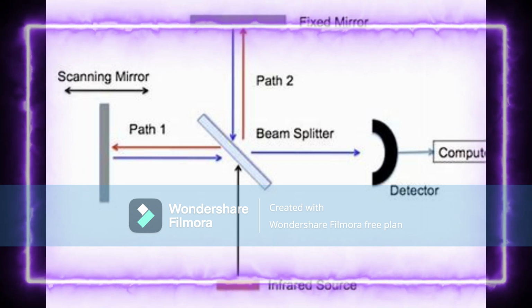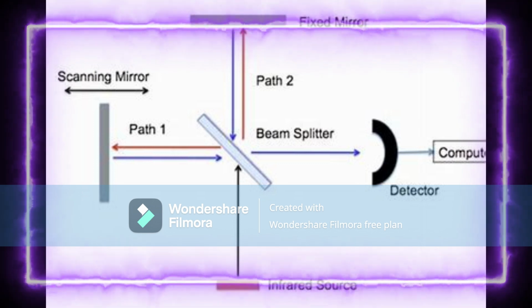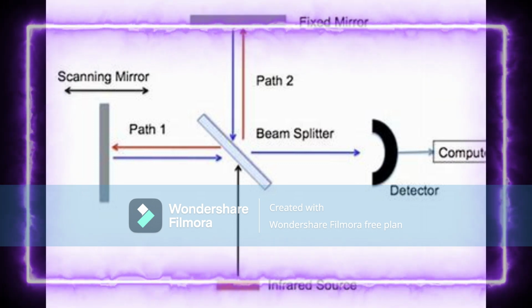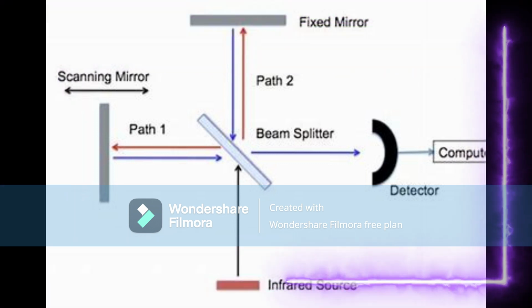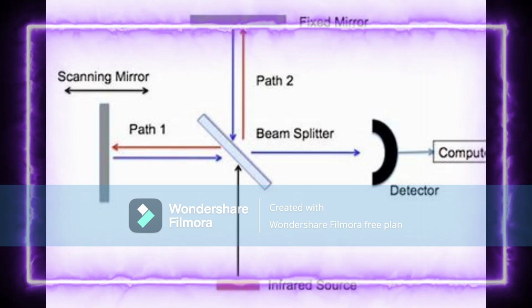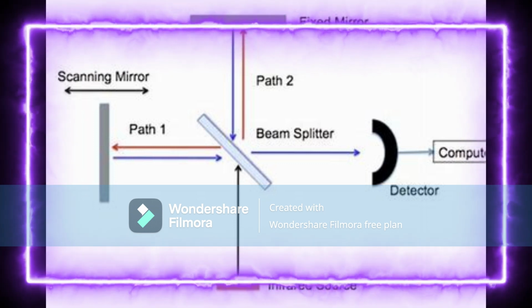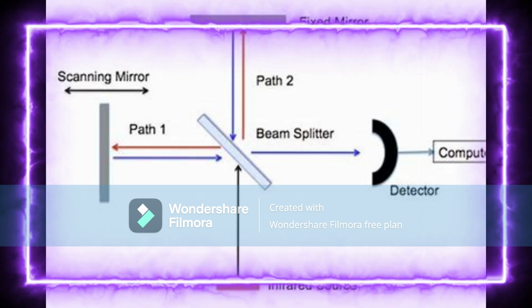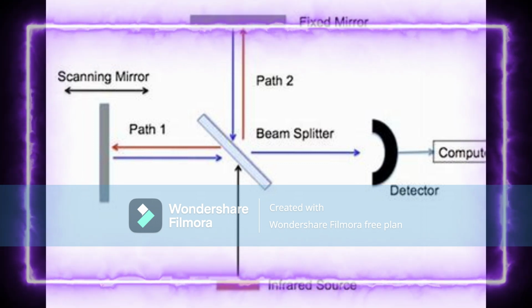A method for measuring all of the infrared frequencies simultaneously rather than individually was needed. A solution was developed that employed a very simple optical device called an interferometer.